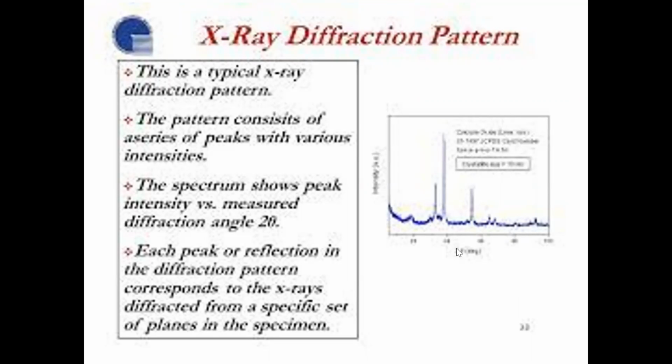This is the diffraction pattern of your X-ray diffraction. We can plot the graph like this. Each peak or reflection in the diffraction pattern corresponds to X-rays diffracted from a specific set of planes in the specimen.